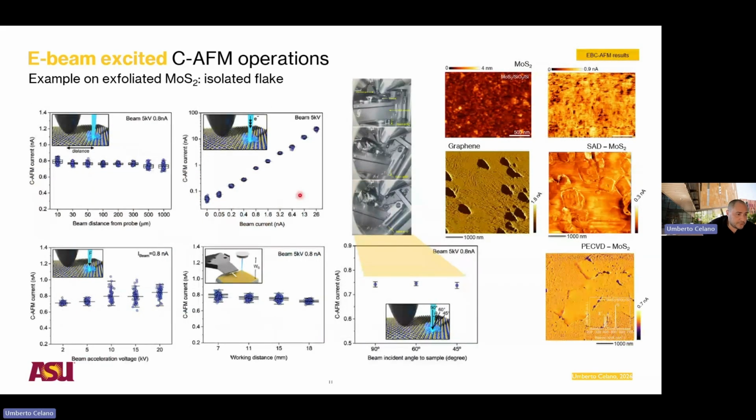Okay, we went over that, and so we looked into multiple types of materials. Here it's a very small showcase where we present a bunch of different types of MoS2, molybdenum disulfide, whether not fully crystallized, whether selected-area grown, whether with plasma CVD. This is probably closer to a crystalline material, while this one is closer to an amorphous combination of molybdenum and sulfur. This one is in between, graphene. In other words, it's just to show you that this is working across different material systems.